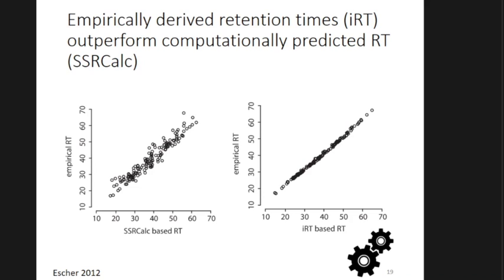Comfortable so far? Yes? So this requires defining the IRT scores in a previous run, and then the correlation will be performed for all future runs? You have to do at least one run with the IRTs in the matrix that you're using. That's an important thing I didn't mention.